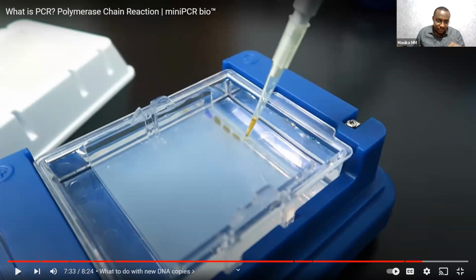And when you run electricity from this side to this side, the DNA will flow. When you take a photo of this, or visualize it with a UV imaging device, you can see the bands of DNA. If there is no band, that sample is negative. If there is a band, that sample is positive. It could be a positive control. It could be the positive sample itself.